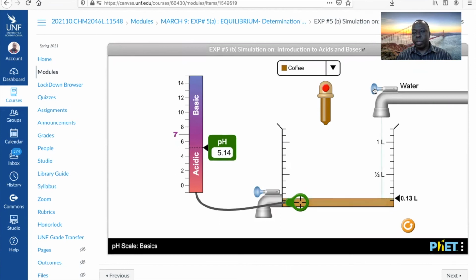So we're gonna try that. If you overshoot beyond 1 liter, you'll have to start over again. So it's gonna be slowly, all right? Initially, you can increase the rate. So make sure that you always have exactly 1 liter after the dilution.